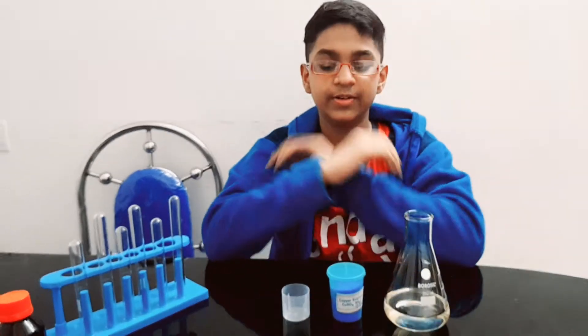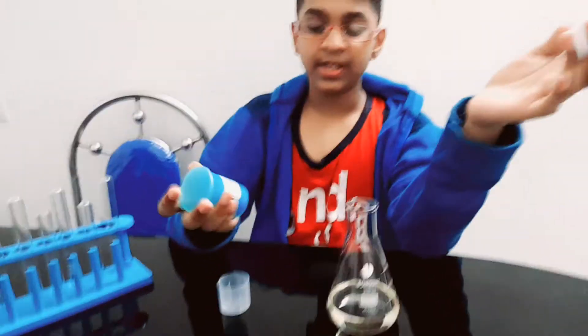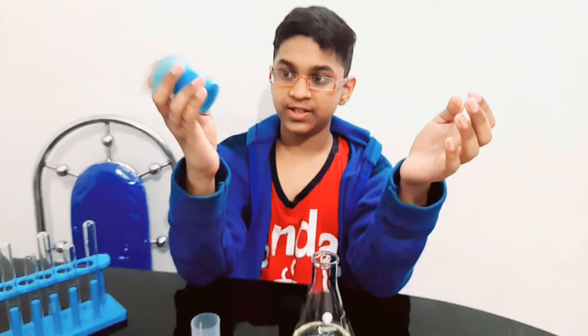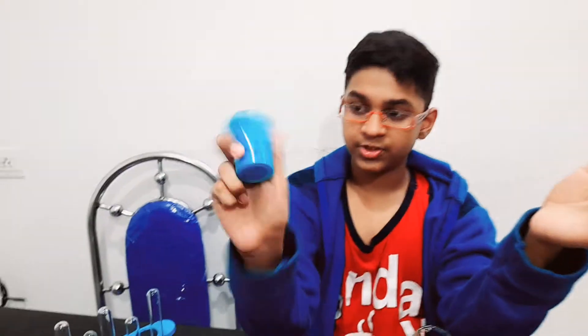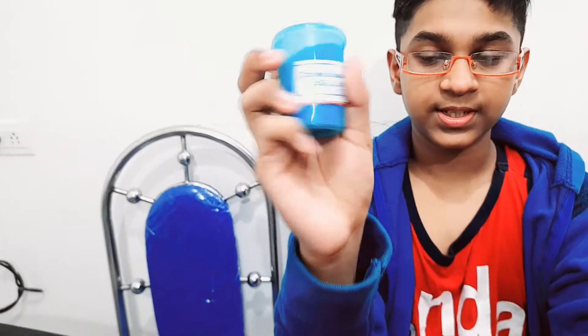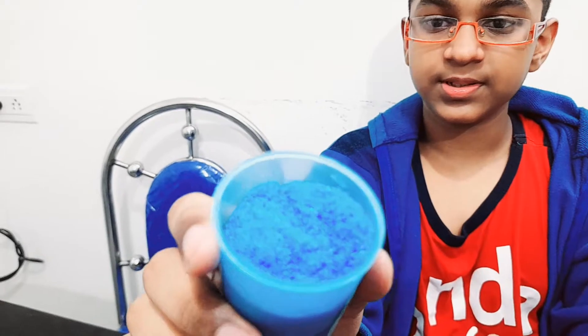Hi everyone! Today I'm going to do a solution-making video — adding copper sulfate powder into water and forming copper sulfate solution. We have copper sulfate powder right here; it's crystals, also called CuSO4. I'm just going to open it — as you can see, it's blue crystals and it's looking beautiful.